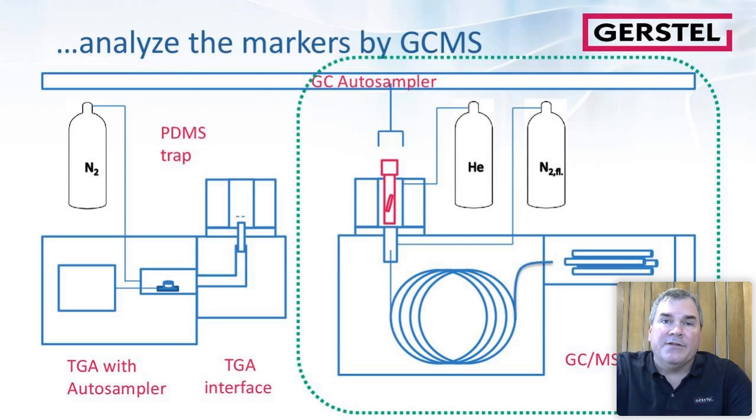I might add, and this is one of the beauties of this, that as a pyrolysis person, I'm really jealous of. While this step is going on, one thing you can do on the TGA while it's not running a sample, you can have the TGA heat itself back up to 1,000 degrees in pure oxygen. Something you can't do on a GCMS system. Obviously, oxygen is a problem for GCMS. TGA doesn't have a problem with that.